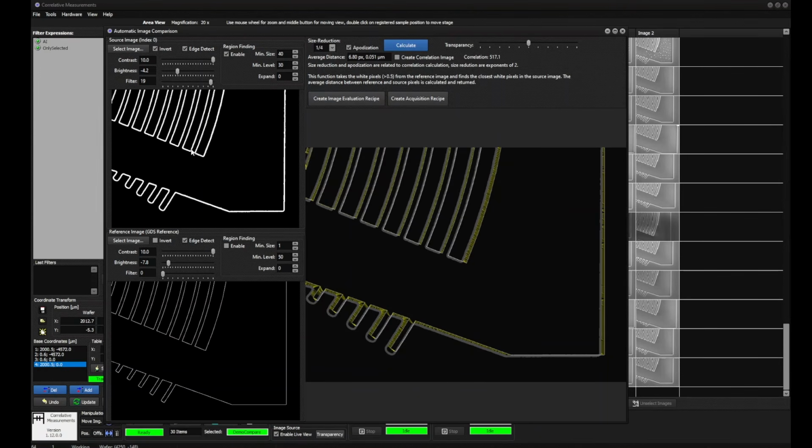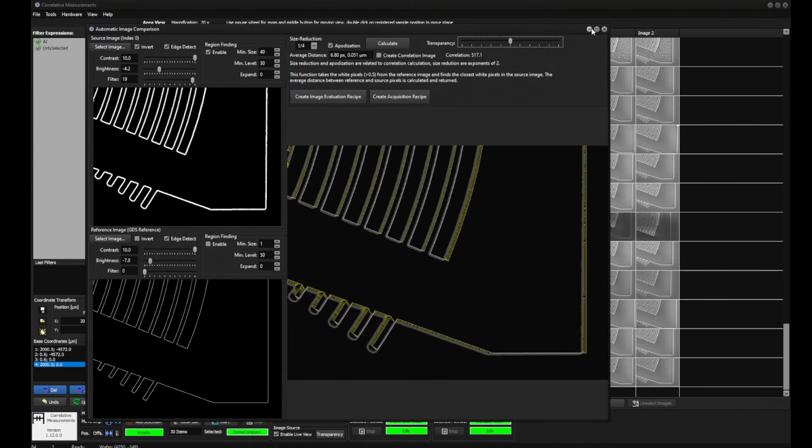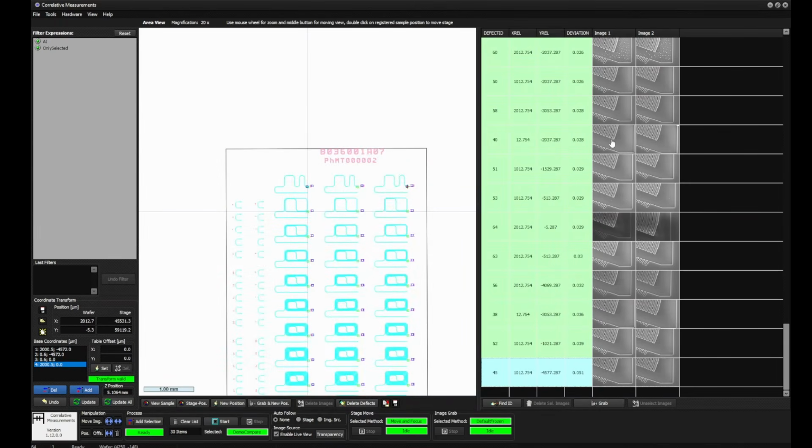They are all, if we compare the structures, they should have been a little wider, and also these here down here, there's a bigger difference between that. So that definitely has less precision than the other one.